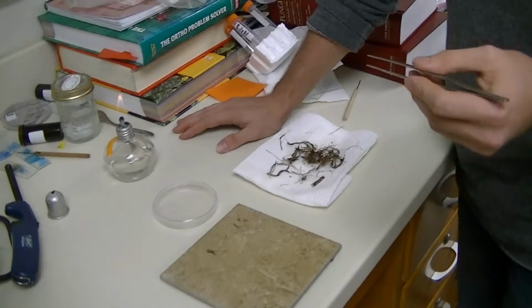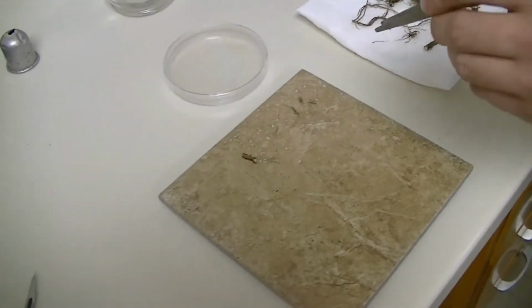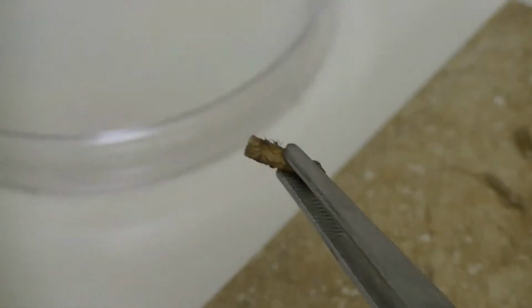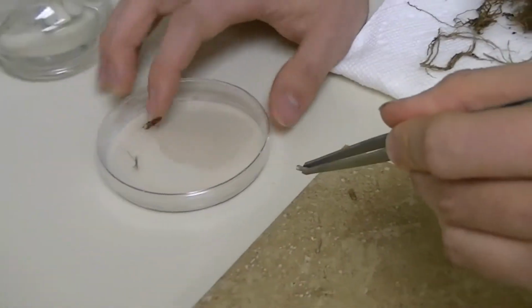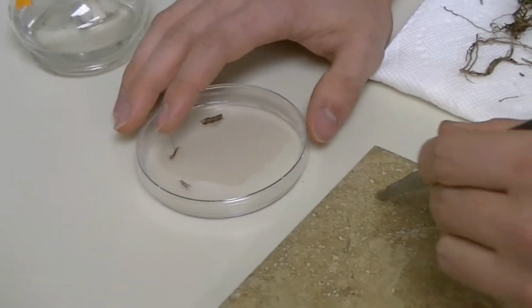So at this point, we've selected roots from our root material and cut them into nice sample sizes. Now when you want to do this, you want to make sure you get a nice mix of both partially dead and living tissue. What you want to do also is maybe sterilize your utensils, which isn't always required depending on what selective media you're using. But basically you've selected your root material, then you have to plate them, put them into their agar. I like to do 4 or 5 samples per plate, so that way I get 4 or 5 chances at getting a nice successful colony rather than just 1 or 2.